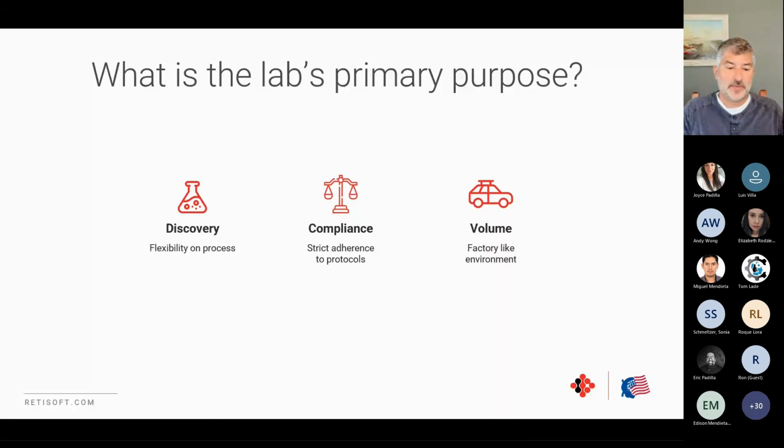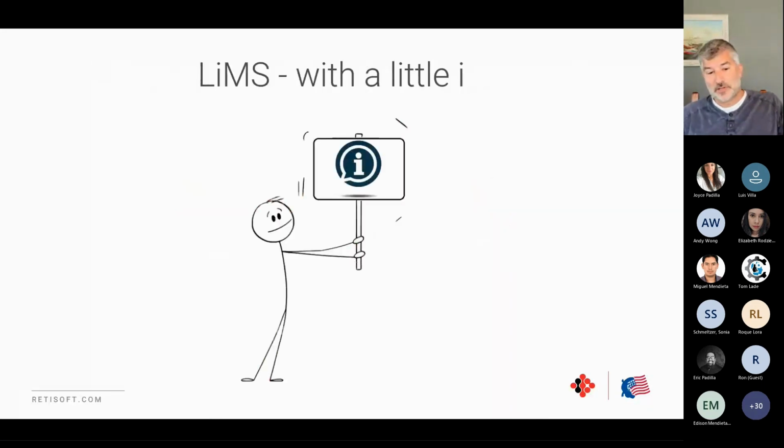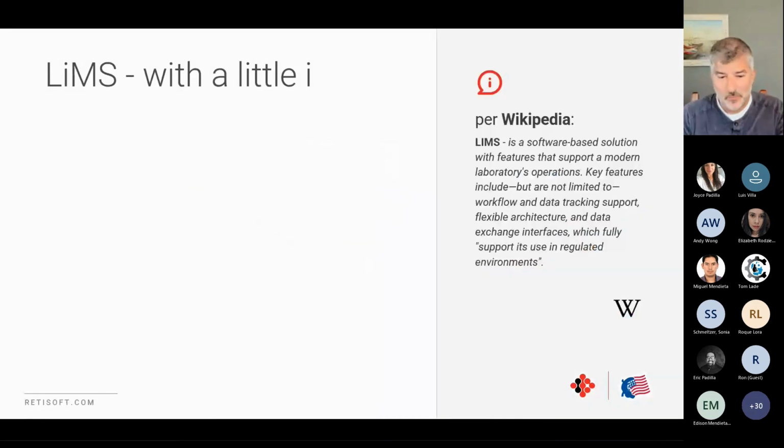So now that you have some vision of why your lab exists and what you're trying to do, let's talk about the LIMS systems. So LIMS with a little i. We'll go back to the i in a minute, but here's Wikipedia's definition of a LIMS. In reality, it's kind of a nebulous software area with many vendors pushing the bounds of functionality.